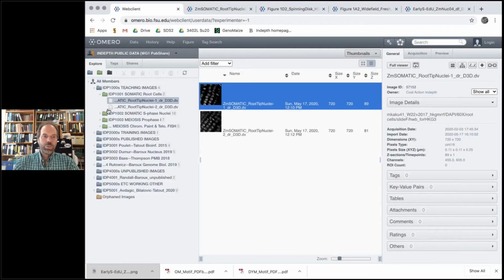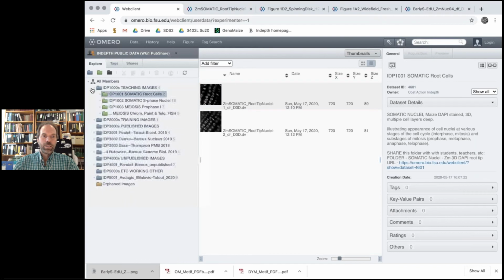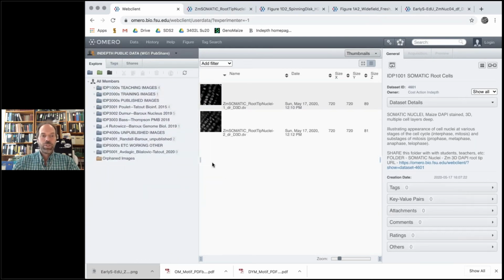So with that, I encourage you to explore this data. Contact INDEPTH if you're interested in having some of your published data uploaded here.